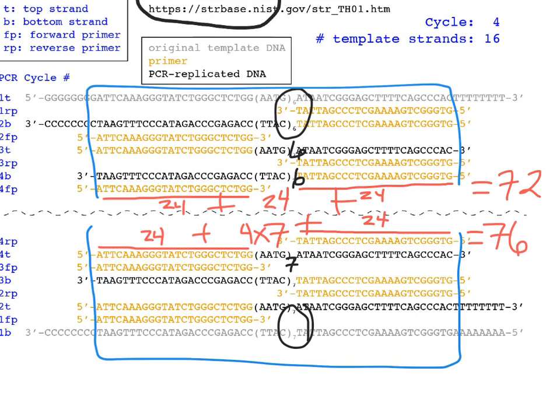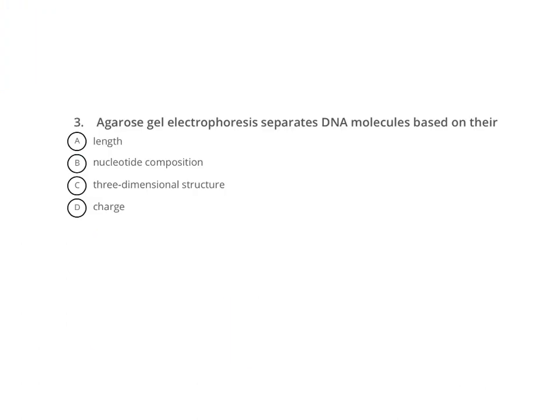So we start with 1 suspect or sample of DNA. If they're heterozygous for an STR or an indel, some sort of polymorphism that changes the size of the chromosomes, if we have primers that flank that difference in size, we're going to make 2 different sized pieces of DNA during PCR. So now that the PCR product is created from a heterozygote, we know that agarose gel electrophoresis separates by length and charge. Charge is essential. Everything that's DNA is negatively charged. If it wasn't charged, we wouldn't be able to do gel electrophoresis. But the primary thing that separates based on size is not charge, it's the length. So charge matters, but that's not what causes the separation of sizes of DNA. It's the length of the molecules that matters.